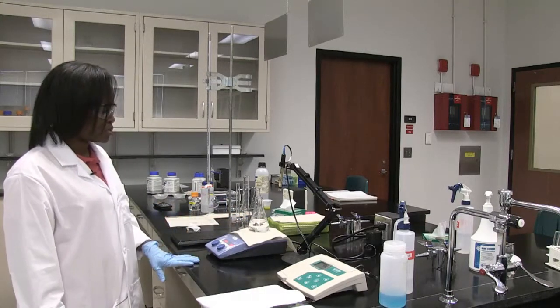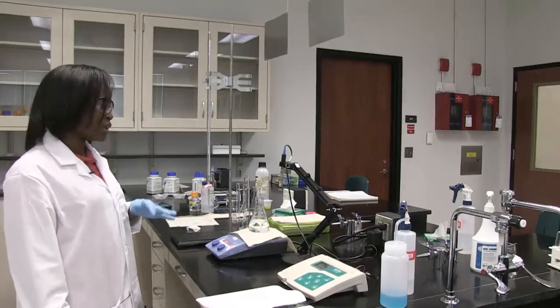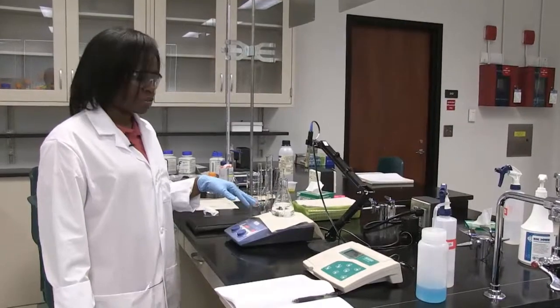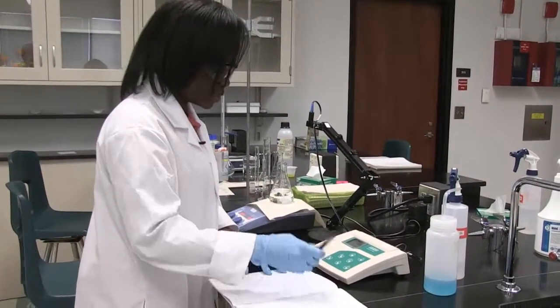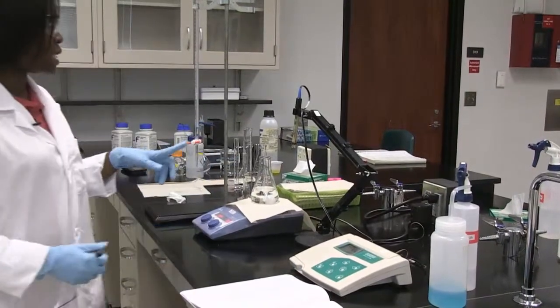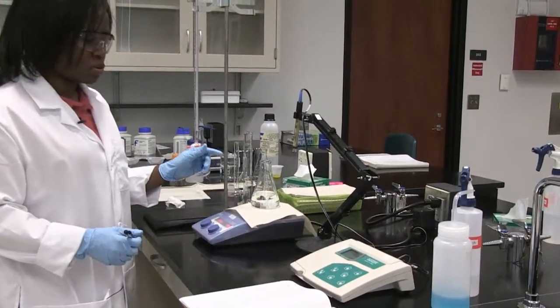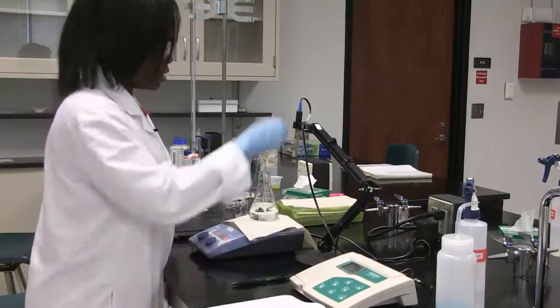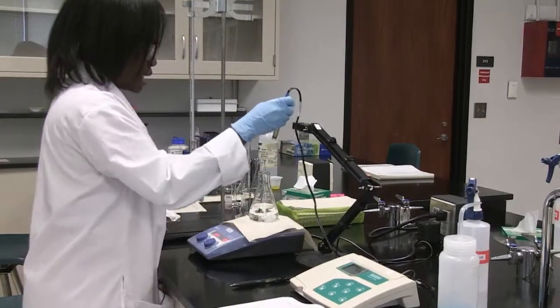The first thing to do is measure the pH before we start any titration — measure the initial pH after you've made the buffer. This is at a volume of zero, because we have not added any base yet. We have to record that initial pH when no base is added.